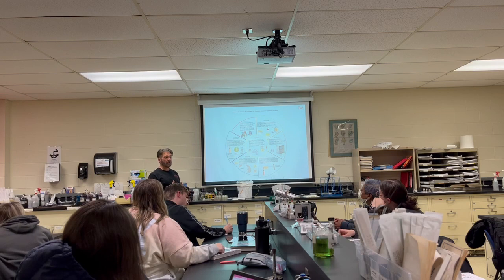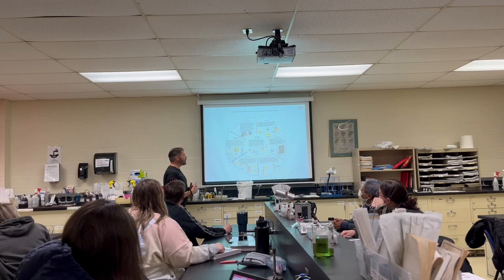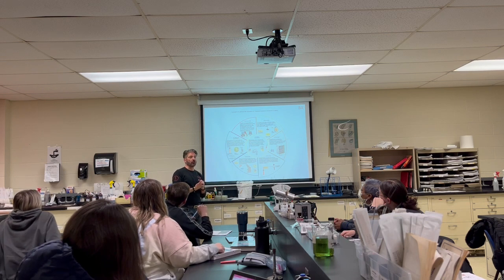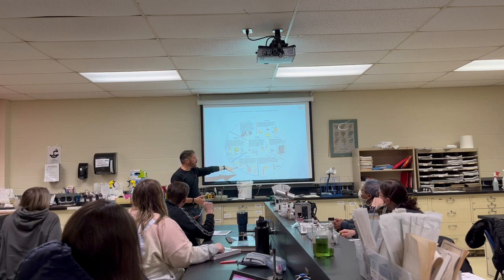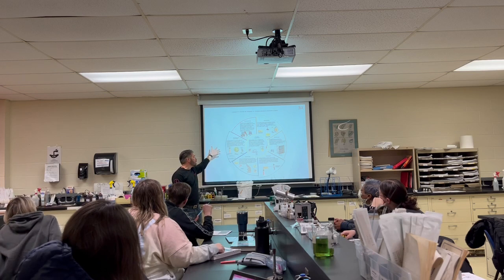Remember I was talking about archaea and some of those bacteria. They're out there, but you're not going to see them in healthcare. Right? The object of the course for me is when you leave the course, you have an idea. When you go to read a report or patient file, you have an idea what they're talking about. Okay, so we're going to go through the steps of inoculating something, growing it. We're going to isolate it. We're going to inspect it. We're going to figure out what it is. And then at the end of the course, we're going to do some testing on different bacteria.